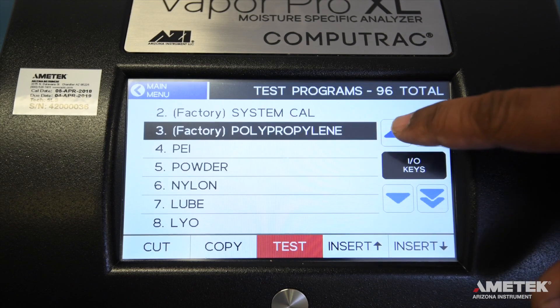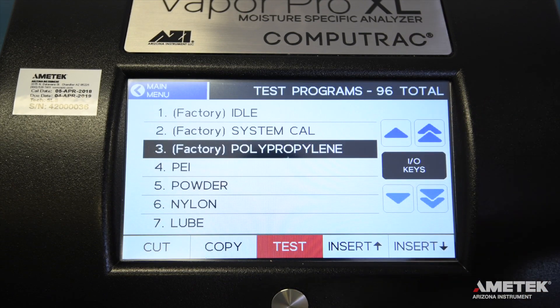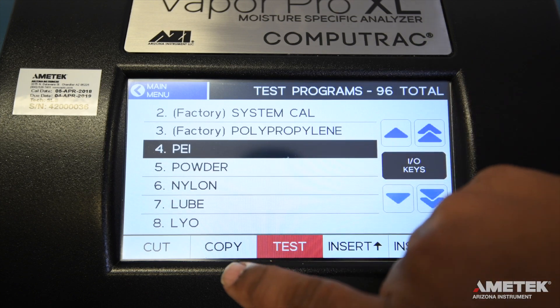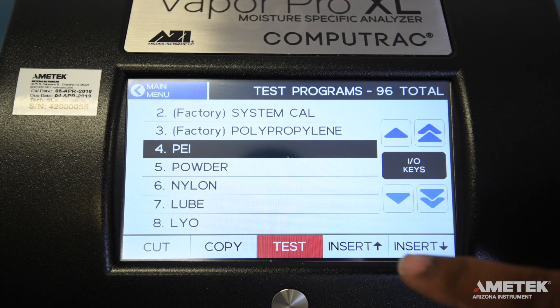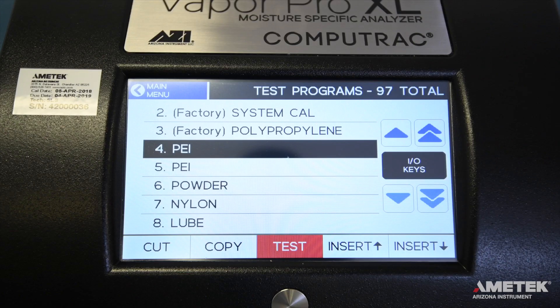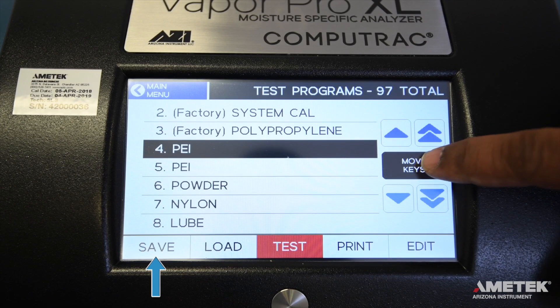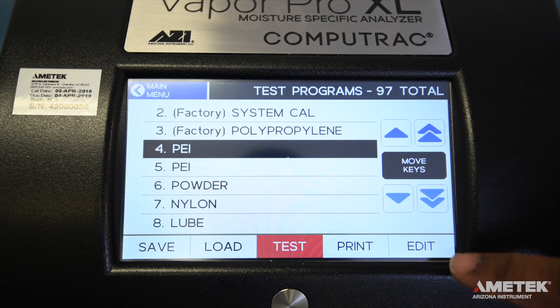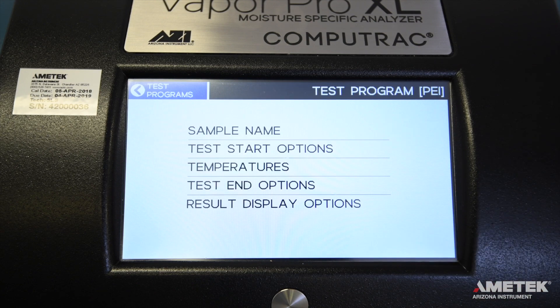Rather than starting from scratch, you can copy an existing program by touching or using the arrows to highlight a program, then pressing Copy followed by Insert Above or Insert Below. Now that your newly created program is listed on the Test Program screen, toggle the buttons on the bottom of the screen so that Save, Load, Print, and Edit are visible. Select the test program you would like to edit and then touch the Edit button in the bottom right of the screen.